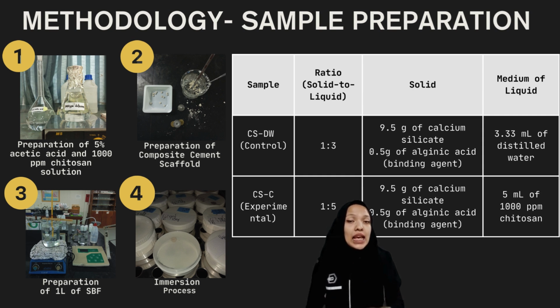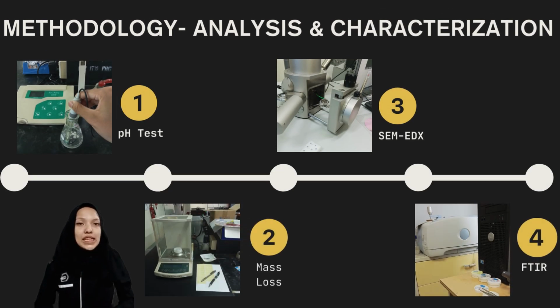After that, SBF was prepared to evaluate the bioactivity of the composite scaffold by immersing the composite scaffolds in an incubator at 37 degrees Celsius for different time intervals ranging from 7 to 14 days. Then, pH test and weight loss was assessed to determine the degradation rate.